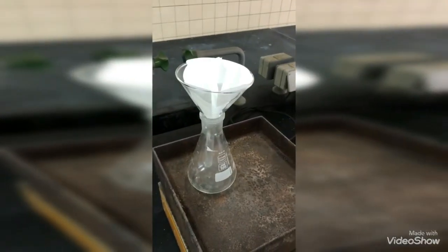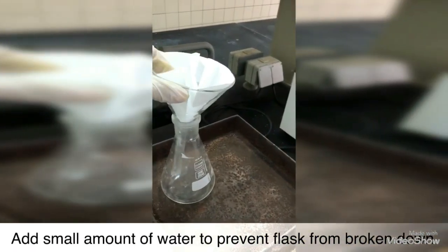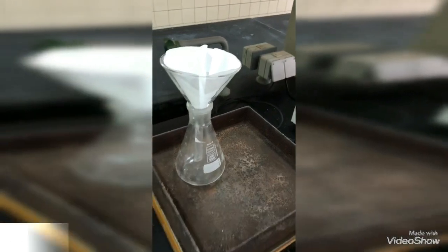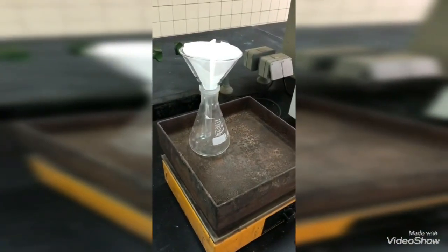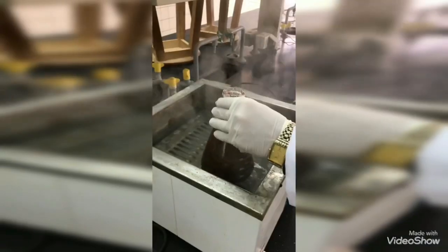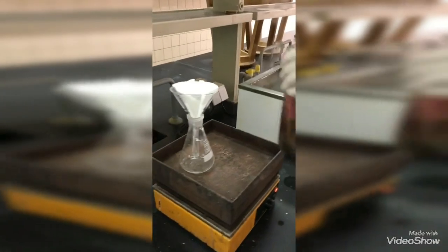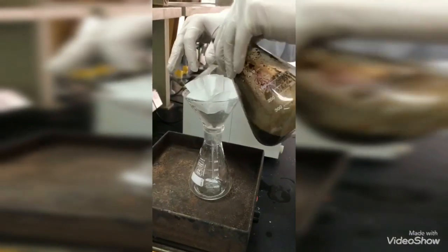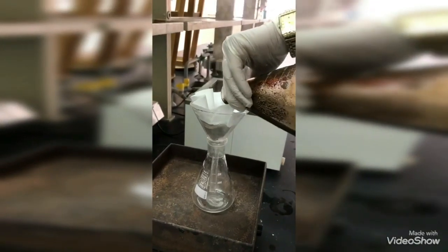Prepare your filtration setup. Add some water to your flask and put it on the hot plate in order to start filtration. After 30 minutes, we will start filtration. Start filtration.